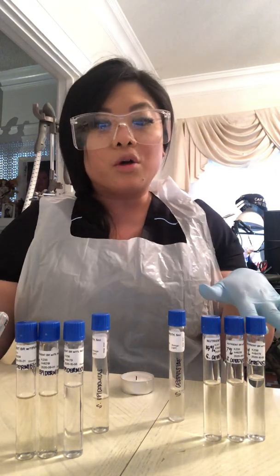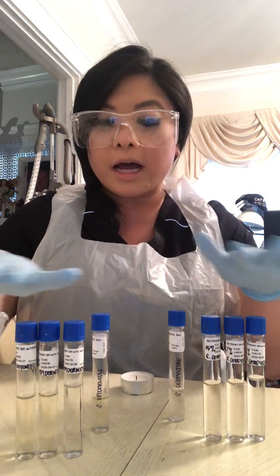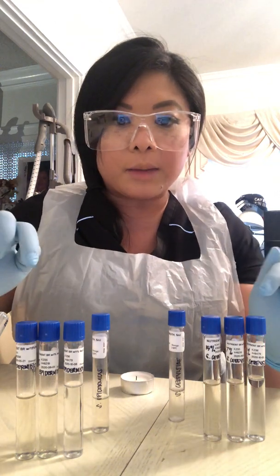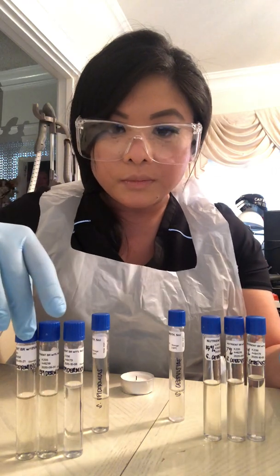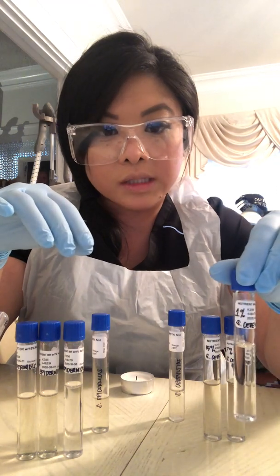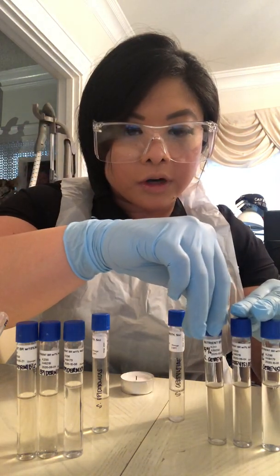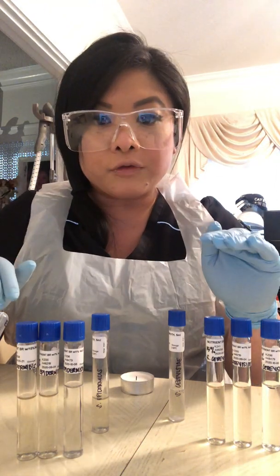I already cleared my work surface area, and I also gathered all my material. I did disinfect my area with 10% bleach, and with a permanent marker, I labeled all of my sodium chlorides. The first one you can see is 1%, 7%, and 15% of sodium chloride. And this I already inoculated with the S. cerevisiae.